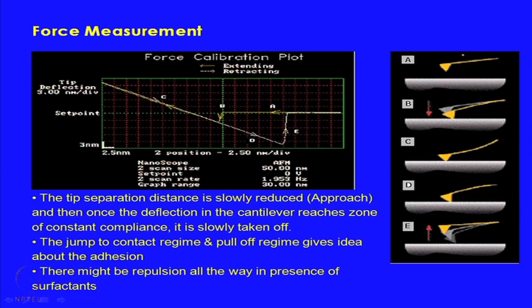So this we understand, this is the cantilever probe at a far away distance. This is jump to contact, then this is in the repulsive regime, and then you try to withdraw. What typically happens is that the attachment and the withdrawal stages are different.